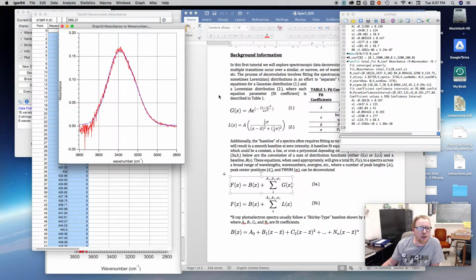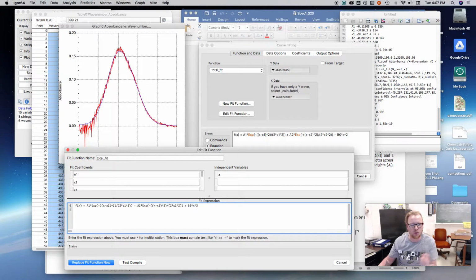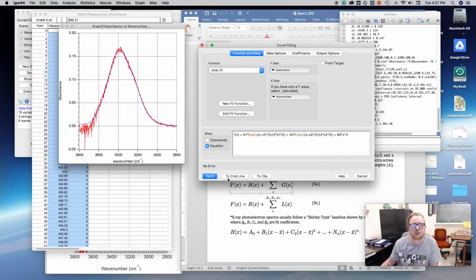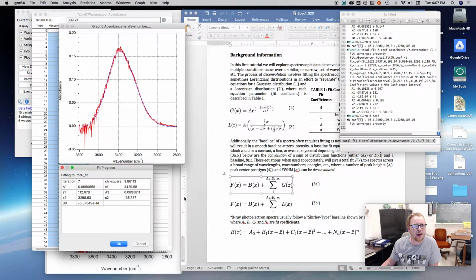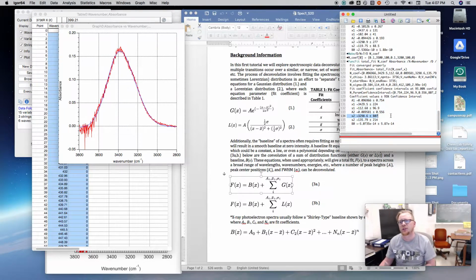And if I go down the line even more, let's make it X cubed. Why not? Replace fit function, do it, and hey, look at that. That's pretty good. And what I'm really looking for is just a qualitative, does it hit all of those data points? So I think that looks pretty good to me. And here you can see that I've got all my new fit parameters. You kind of have to accept them, with these large plus or minuses.